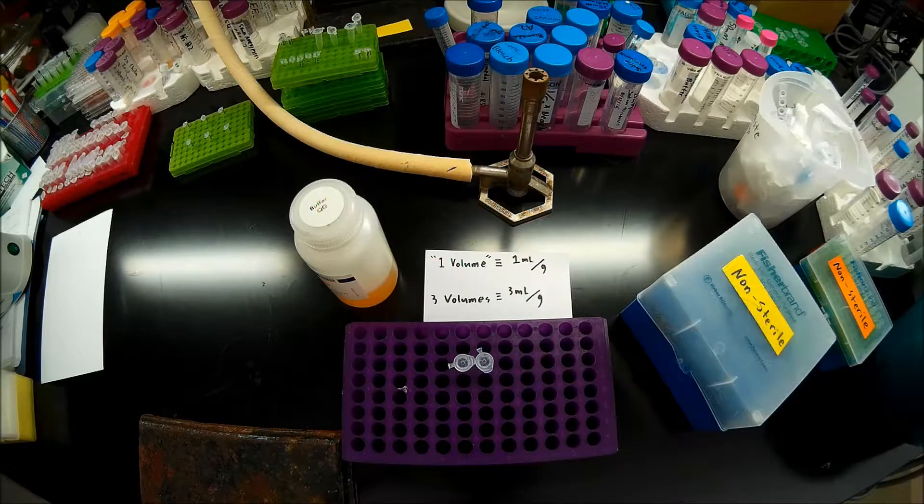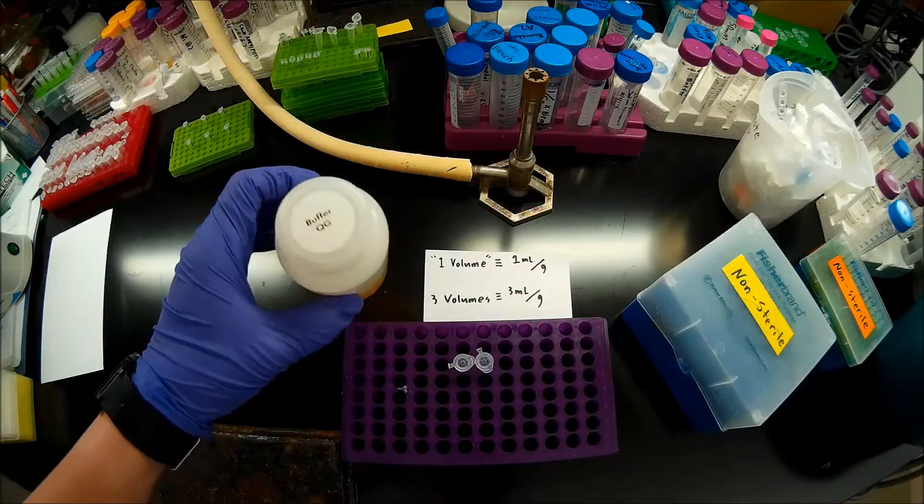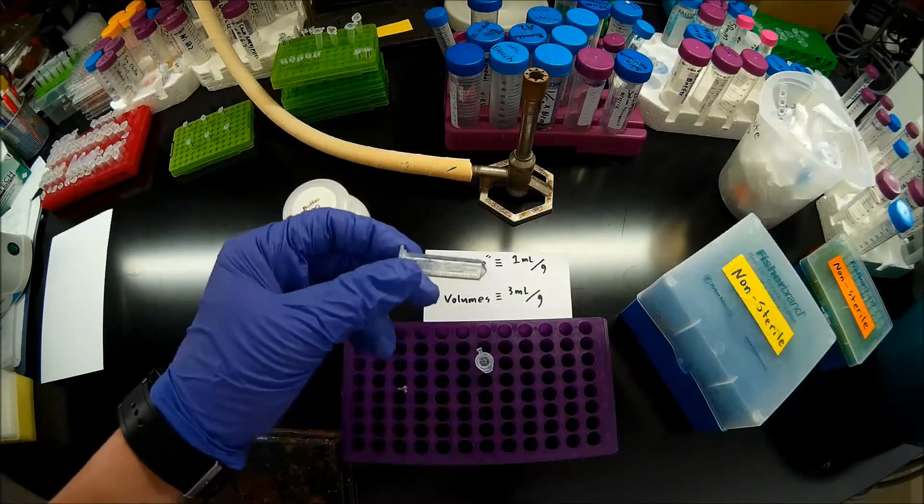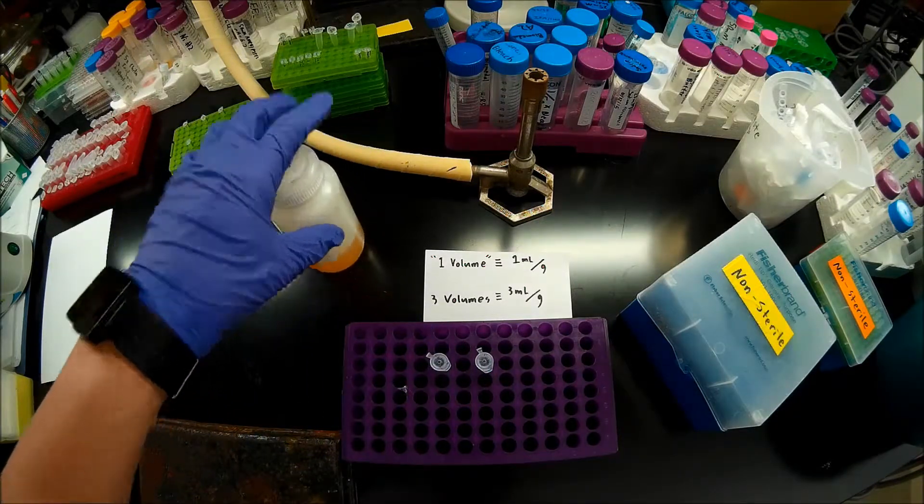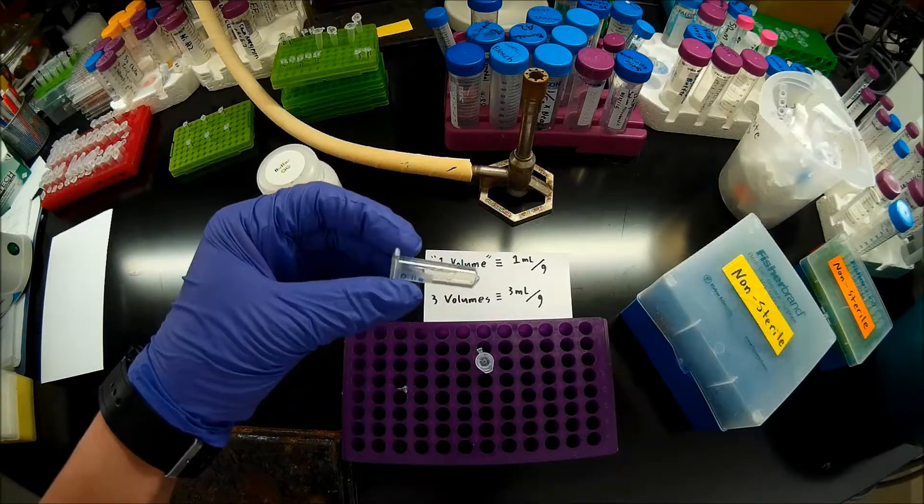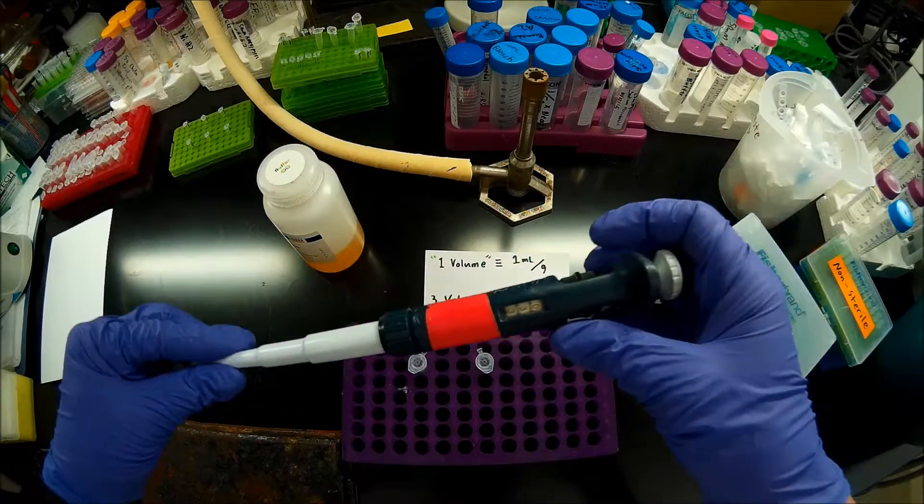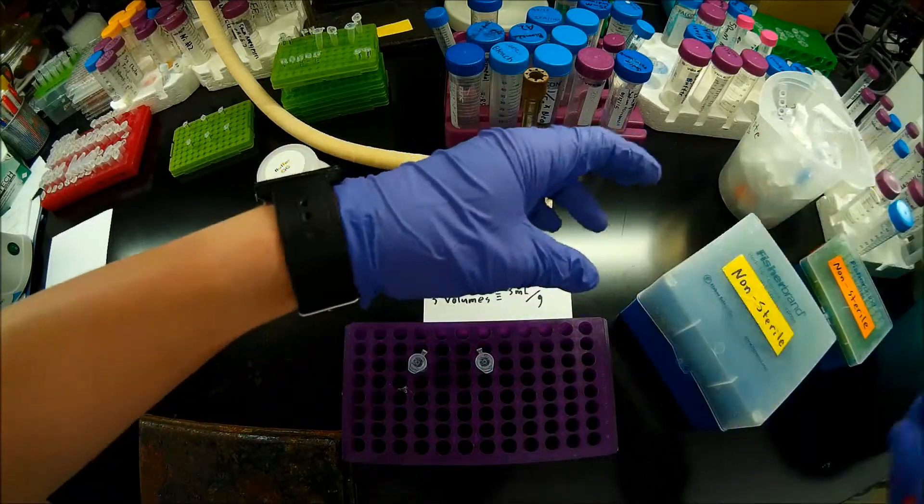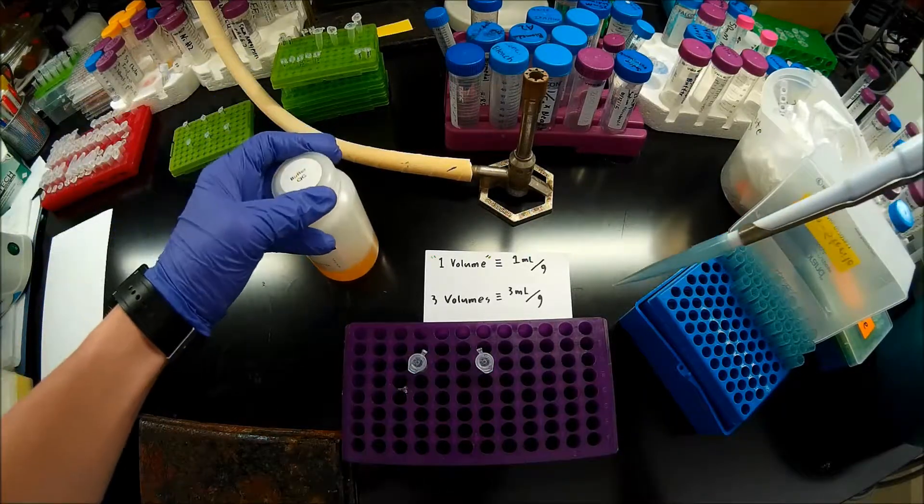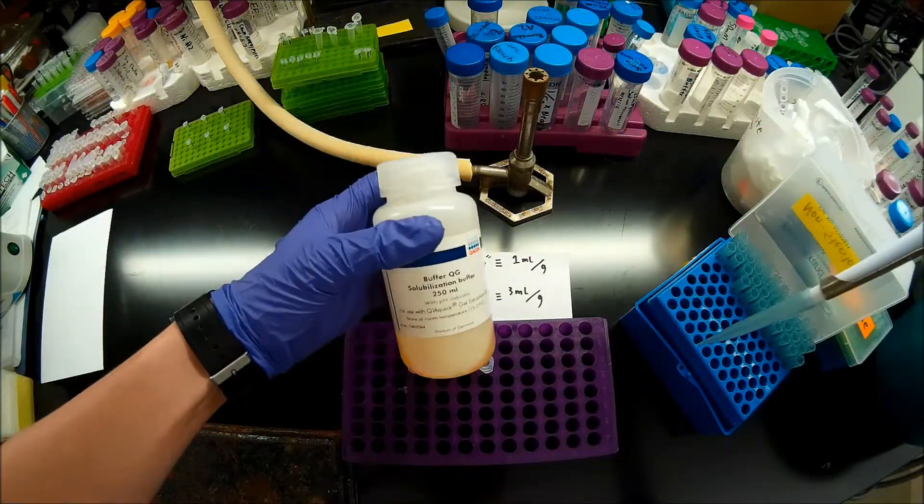So we're going to add the agarose slabs so that we can get the DNA out. So we're going to do that by adding QG buffer to them. For this procedure, we add three volumes of QG buffer to our agarose slabs. So what we mean by a volume, one volume when we say that, that's equal to one mil per gram. So we have 0.11 grams of agarose slab in here. So we're going to add 0.33 mils. So I'm going to take my P1000 set to 330 microliters. And I'm going to pipette that into the first one. Note that I'm not working sterile here because we're going to be doing a cleanup on these later anyways. So again, this is a QG buffer.